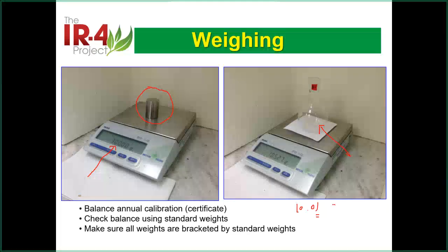Your verification range should go up to the highest weight for everything, for example 200 grams, including sample and bottle. And the lowest is about 1 gram, so you need to verify down to 0.01 gram in your lab.